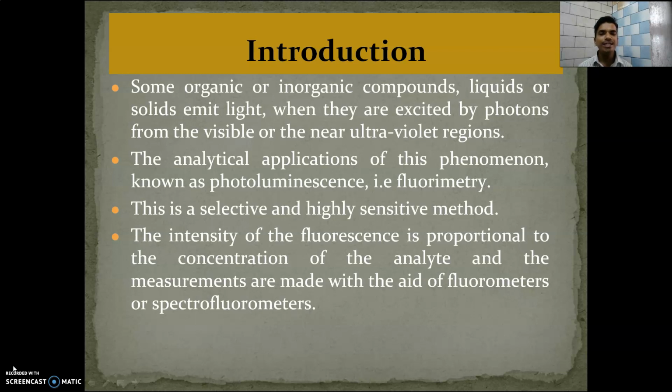This is a selective and highly sensitive method. The intensity of the fluorescence is directly proportional to the concentration of the analyte, and the measurements are made with the aid of a fluorometer or spectrofluorometer.